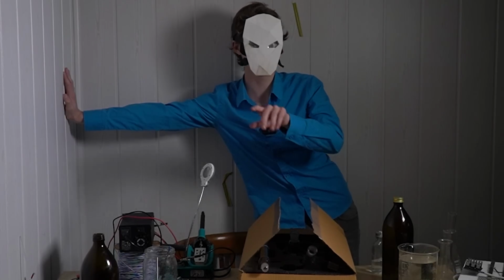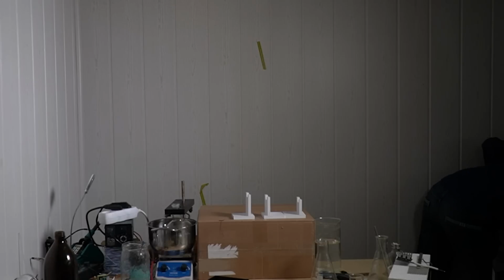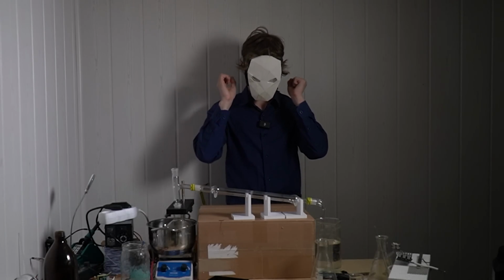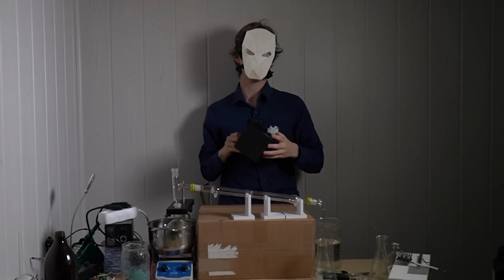Just this glassware, not all the other things I'm gonna bring up. Okay, so at this point we got the setup, and right here we have the distillation set. One problem, however, and that problem is that this isn't exactly working.